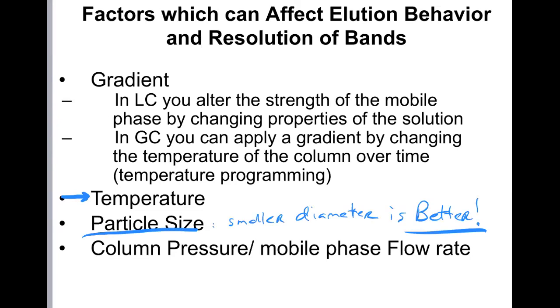There's actually a couple of reasons for that. Thinking back to our Van Deemter equation discussion, those factors that affect plate height. Remember two of those terms. One, for packed columns, was the irreproducible flow path, and this idea that not all molecules take the same flow path, okay? Well, it turns out if you make the particles smaller, you can generally achieve a little bit better packing in the columns. So the breadth of the flow path distribution in a well-packed column can be minimized. In other words, all molecules don't take the same path, but more similar paths, we'll say, okay?